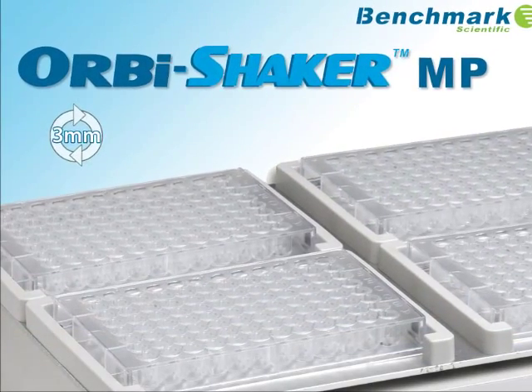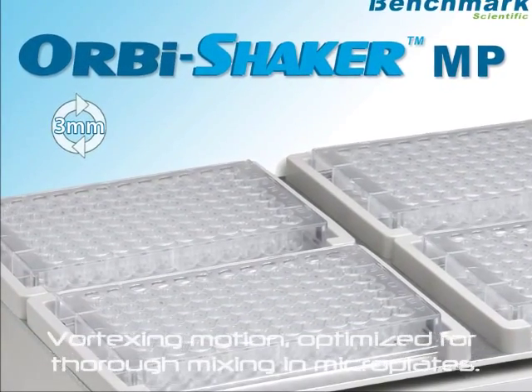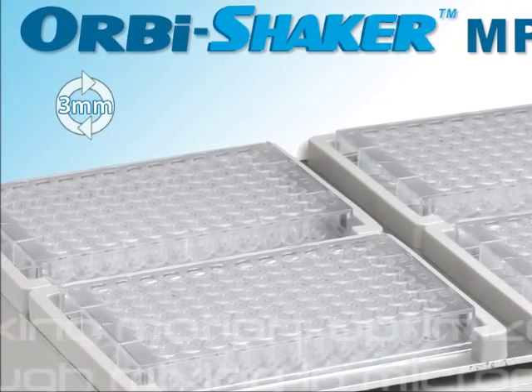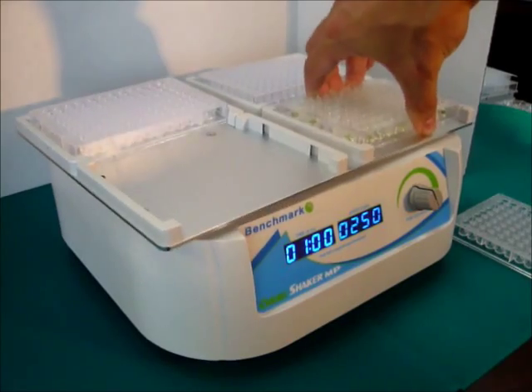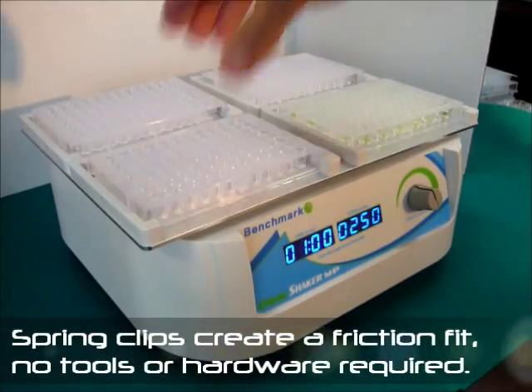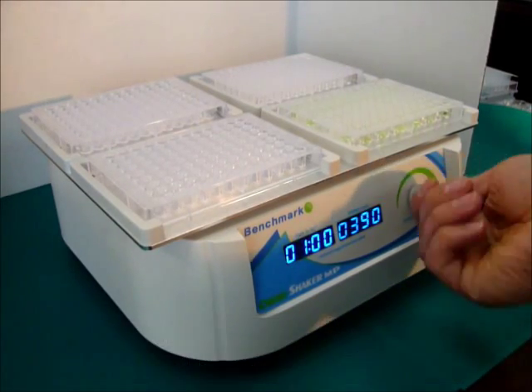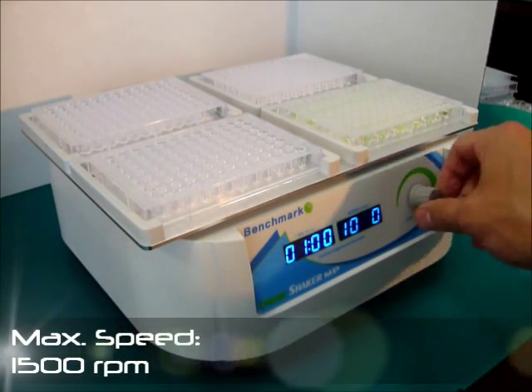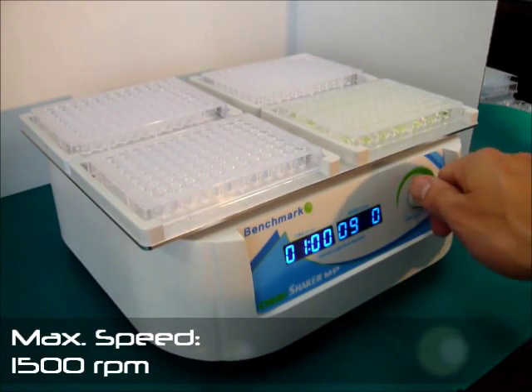Benchmarks Orbi Shaker MP, a vortexing shaker optimized for thorough mixing in microplates. With digital control and a spring clip securing system, the Orbi Shaker MP is quickly set up for use. Simply snap the plates into place and set the desired speed and time using the control knob, then press and hold the control knob to begin mixing.